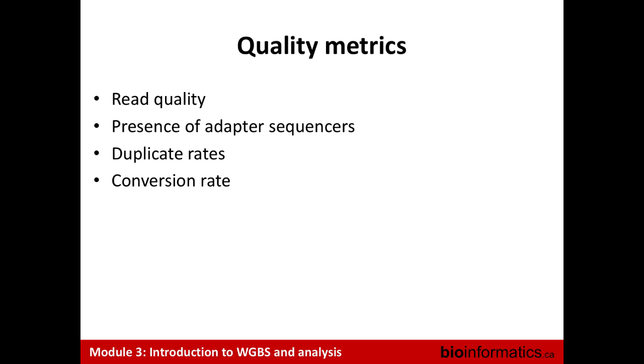And conversion rate, actually, if we have time, we won't do it in the lab itself, but it's important to report on these conversion rates. Usually in the sample preparation of these bisulfite conversions, you have sequences that are not methylated, or that are fully methylated, and that allows you to estimate the conversion rate. So we won't do that in the lab itself, but I'll show you where that data is for some other data sets.